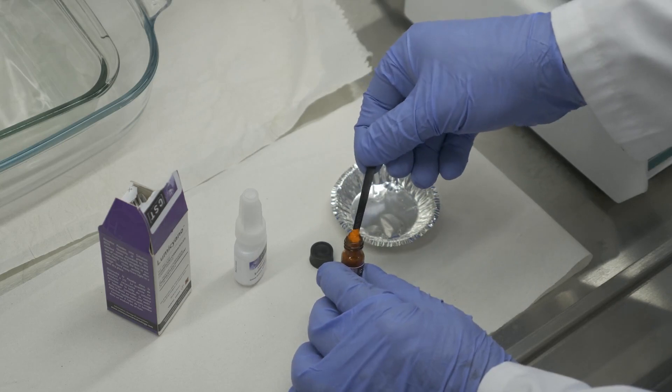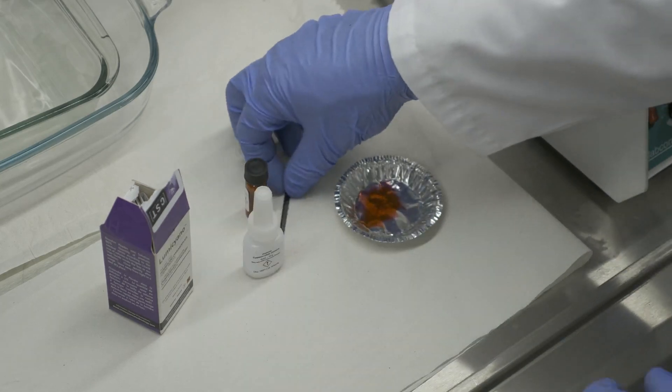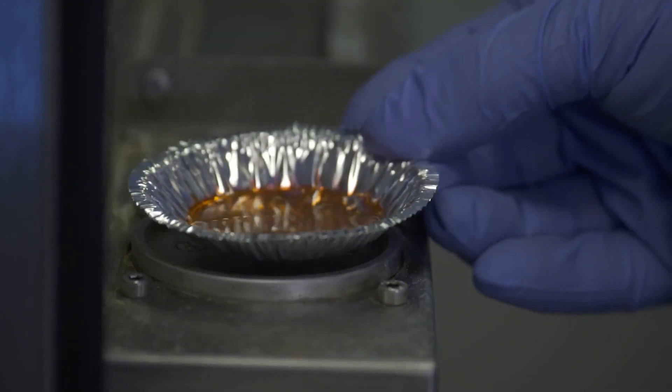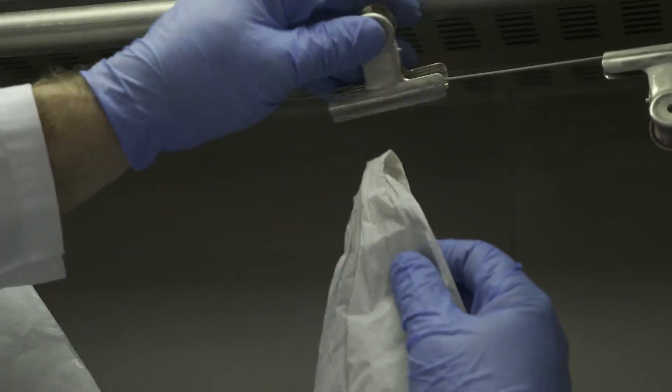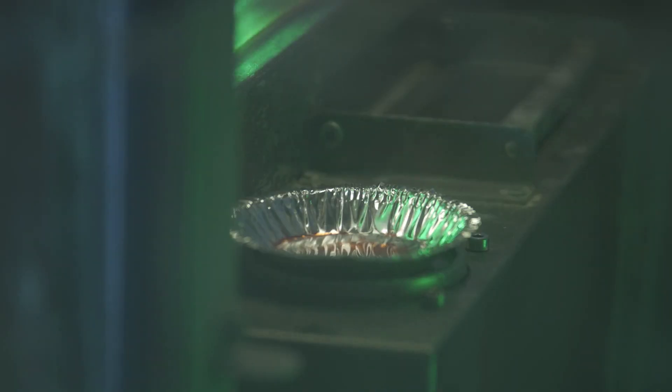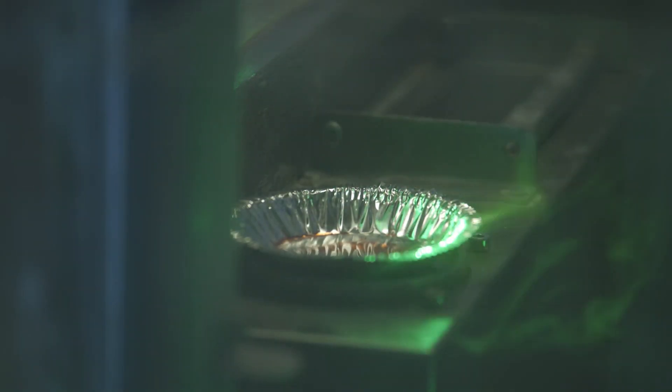Can you tell me how that process compares to the new process using LumiCyano? The new process basically works like this: you mix your superglue with your dye stain, which is all in one process. You do this in an extraction chamber because there's chemical wastage into the air. From the chemical extraction chamber, you take your bucket with superglue and dye stain mixed, and you place it in the superglue chamber where you fume your evidence. When the evidence is fumed, the superglue and dye stain react with the fingerprint on the evidence, so you don't have to dye stain it afterwards. From your fuming chamber, you can go directly to your visual area and with your different light sources, you can visually look for physical evidence and photograph and capture it.